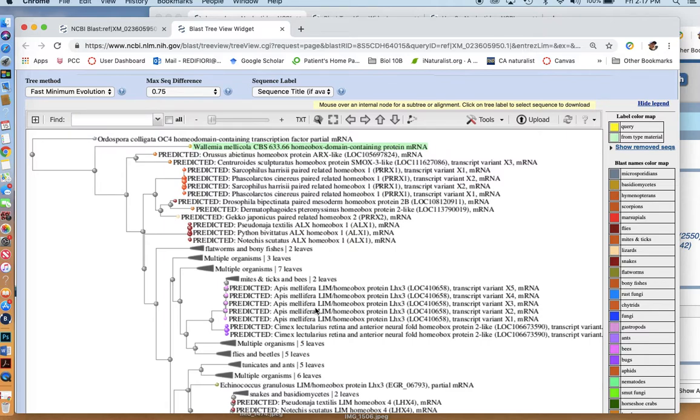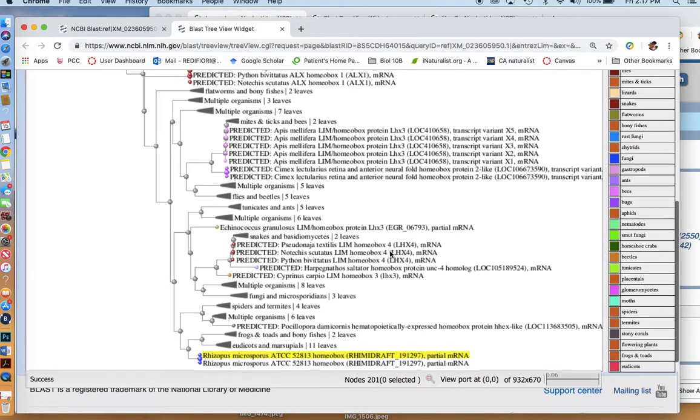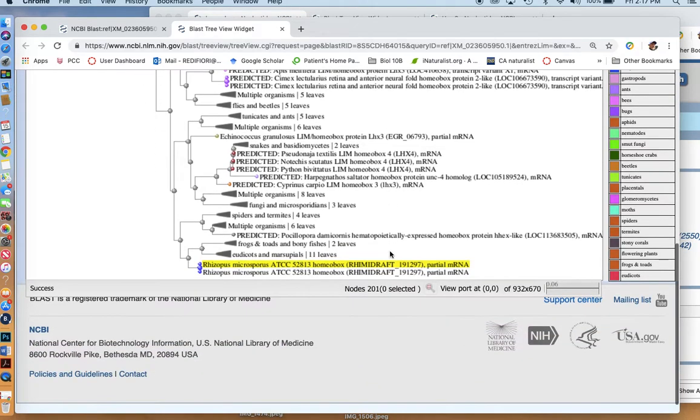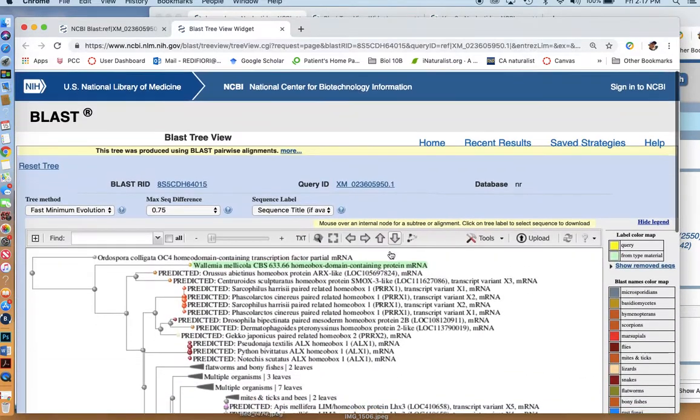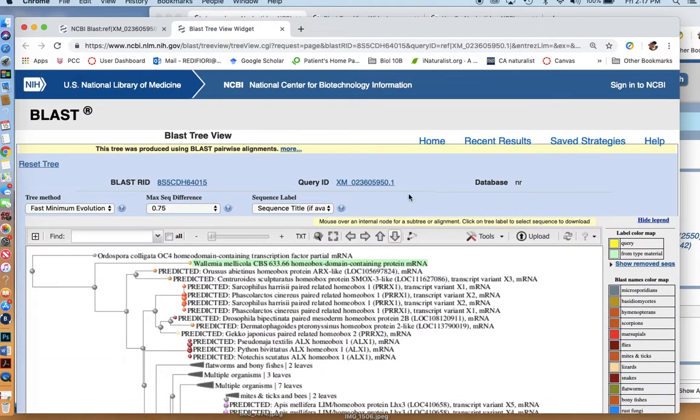If they're different, you might be looking at different evolutionary mechanisms generating these different patterns, indicating that animals might have a much more complex evolutionary history. So there you go. That's a brief, quick look at how to use the BLAST tool.